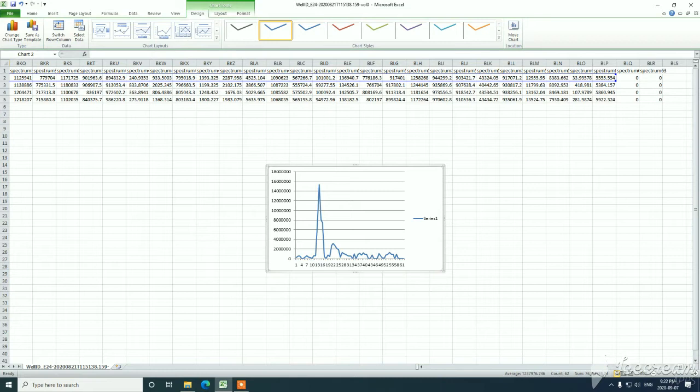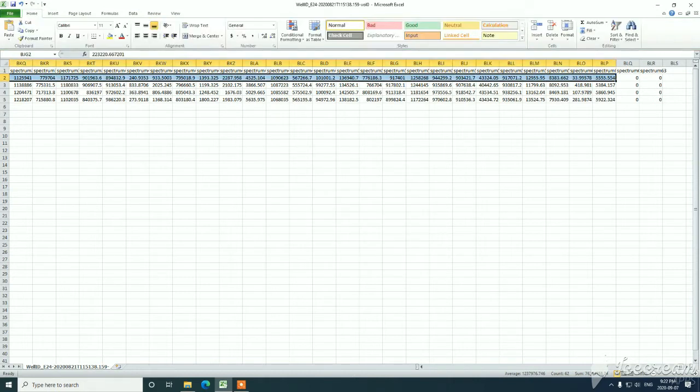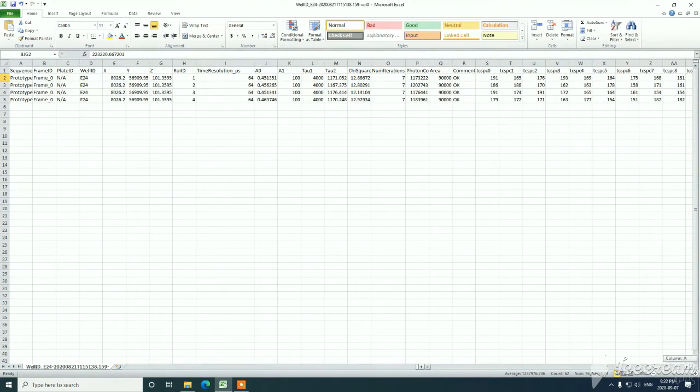You can see there's a sharp peak in this region, and if we were to map the emission profile for fluorescein, we'll see that this will match it exactly. Again, these are the data generated for each ROI, and this can be generated without having the INO FHS software.